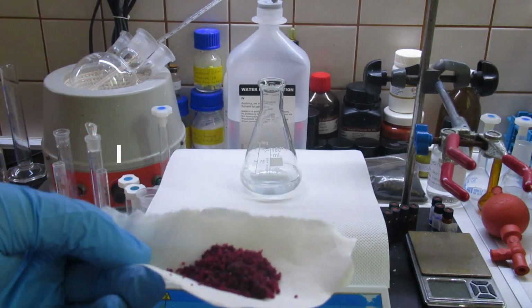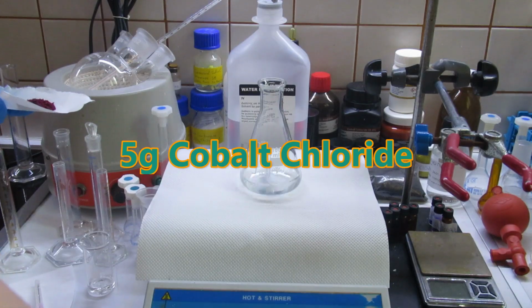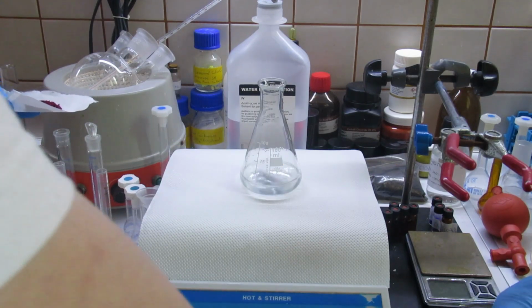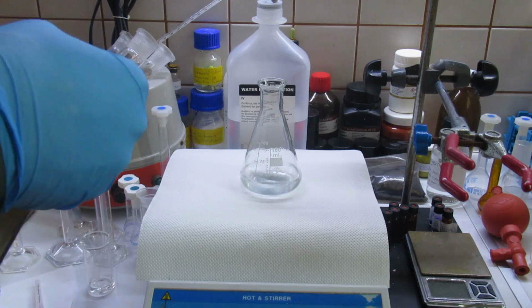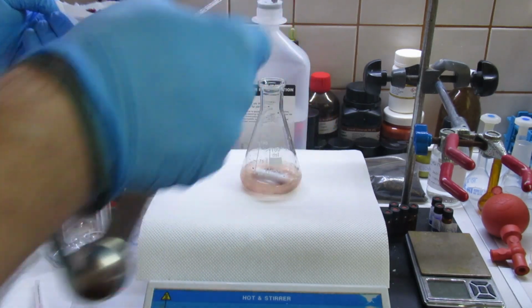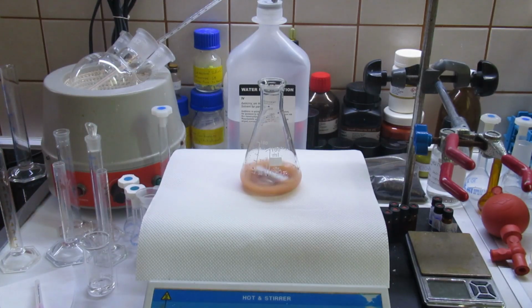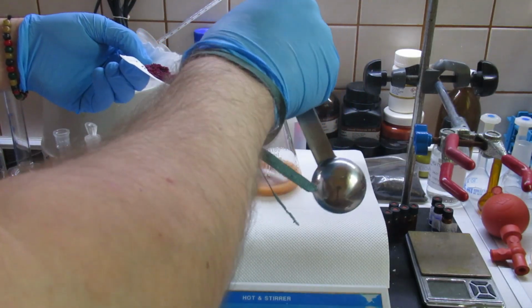five grams of cobalt chloride, which will be added incrementally and form an orange yellow slurry.